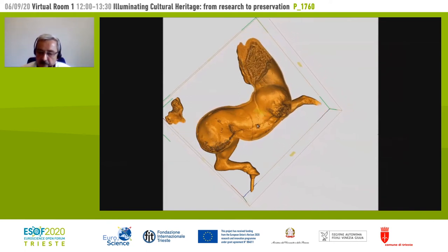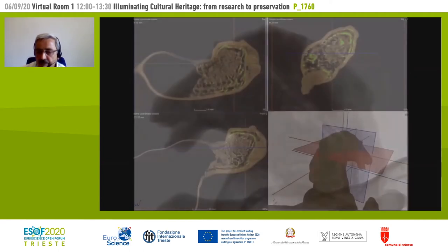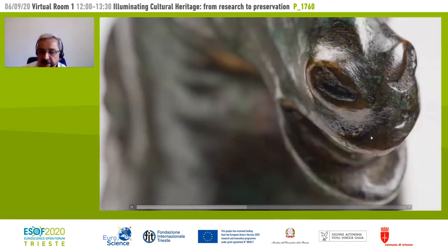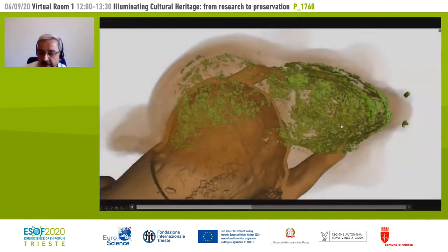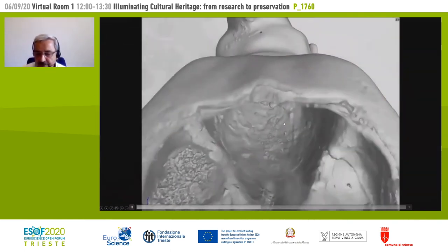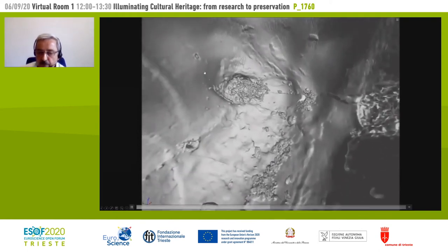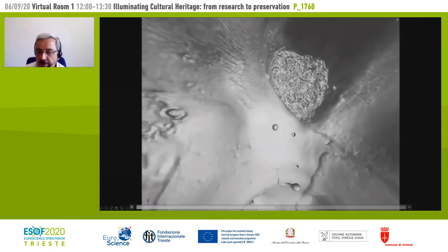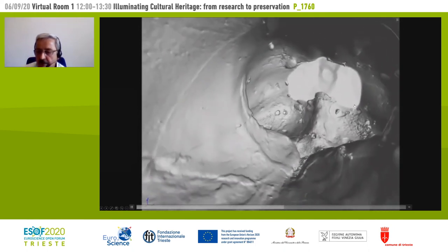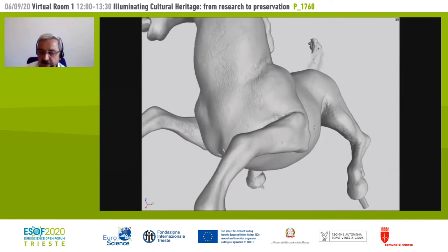Then you can also see the slices. Now this is the radiography of the head. Then the remnants in the head, from various directions. And this is a picture of the horse nose. Then again, remnants. Now we will travel inside the horse. And you can see the leg from which the knot removed parts of the core material, and this is the head with the gypsum remnants. And now we turn around and go backward, go out from the horse at the front part of the horse.